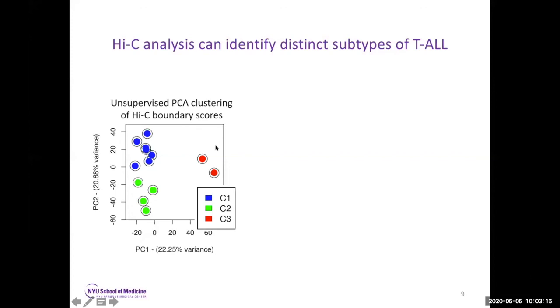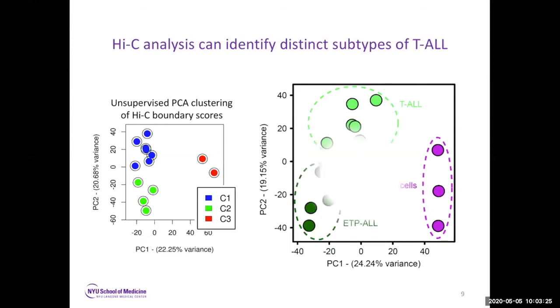And if we're breaking them down based on the identity of the cells, hematopathology data, and also FACS data, they break exactly like that. So up there we can see what I called a conventional standard T-cell leukemia. On the right here of the PC1 is normal T cells. And down there we can actually see what we call ETP-ALL, which is basically, as I've told you before, an earlier in differentiation subclass of ALL.